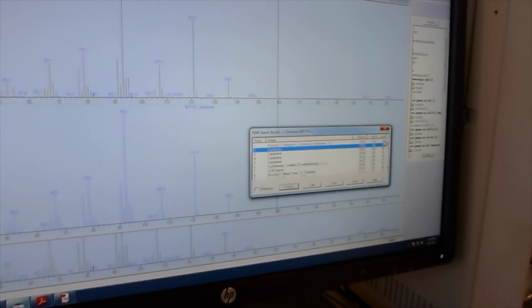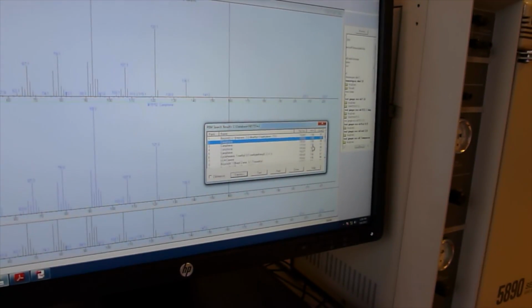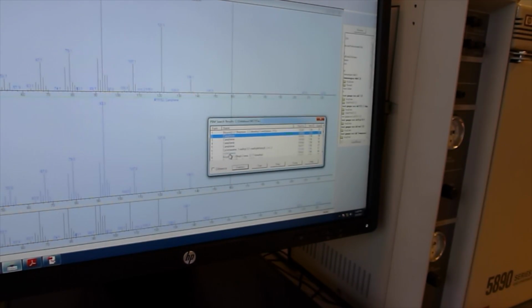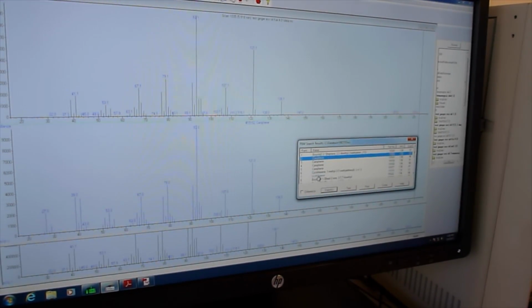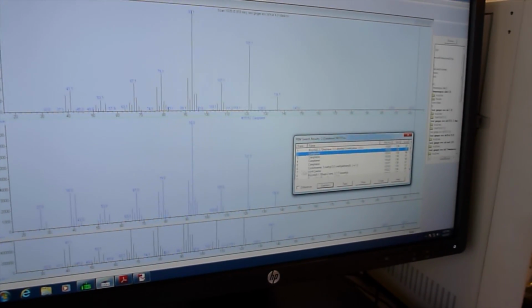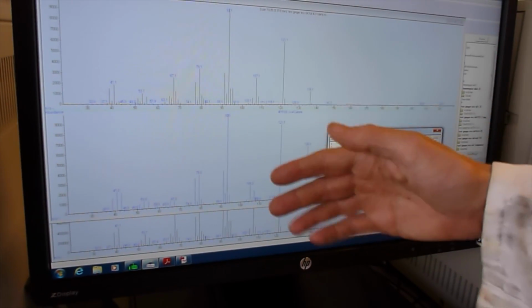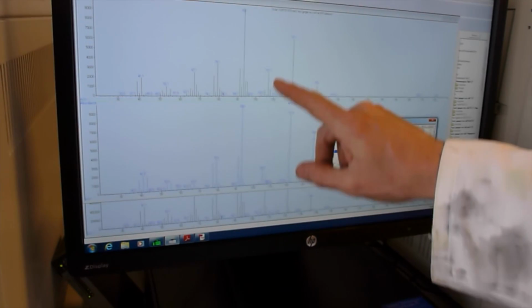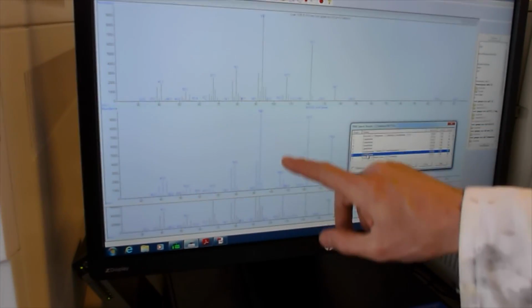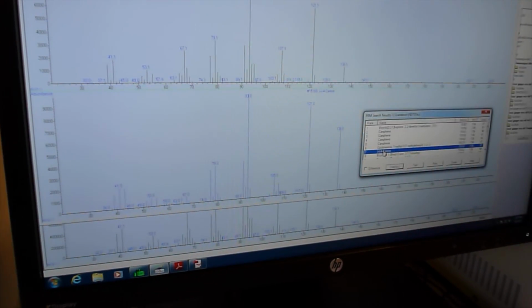But you see this is the quality, so the higher the number, the better the fit between your spectrum and the library spectrum. If you go down a little bit to, for instance, 4-carene, which is a different compound with a fit of 87, you can see it also looks quite similar to your spectrum, but there's an important change here between the fragment at 107 and the 105. So this is definitely not your compound.